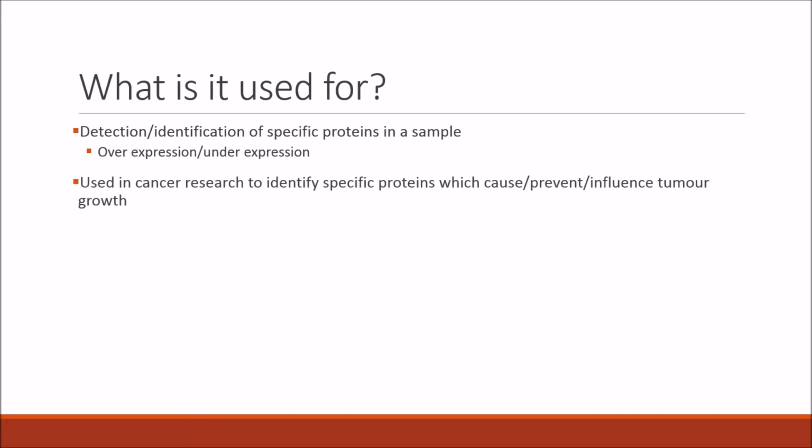This application is quite commonly used in cancer research to identify specific proteins which cause, prevent or influence any tumorous growth. It's also used in research for Alzheimer's disease, and it's also being used for the diagnosis of Lyme disease, which can then be linked with an ELISA test, which stands for Enzyme-Linked Immunosorbent Assay.